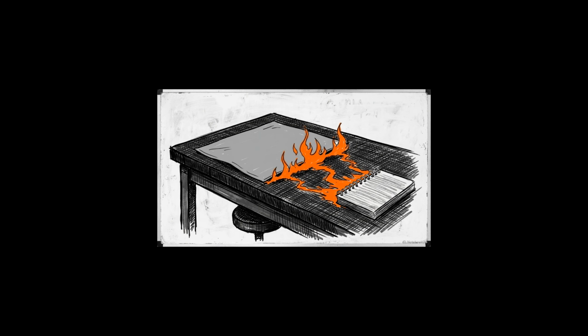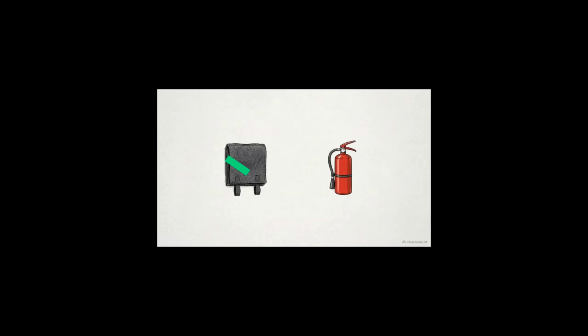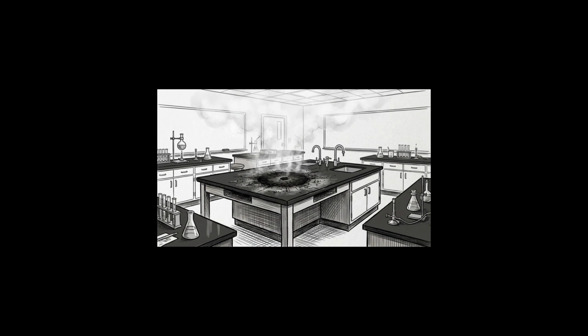If the blanket fails to smother the fire and the flames begin to spread beyond the immediate area, you have crossed the protocol threshold. You must abandon the blanket and retrieve the fire extinguisher. This diagram illustrates the PASS method, which dictates the correct sequence for operating the extinguisher. You pull the pin, aim the nozzle at the base of the fire, squeeze the handle, and sweep from side to side until the fire is out. By mastering the exact physical techniques for the fire blanket and the extinguisher, you ensure a localized bench accident is quickly contained before escalating into a facility-wide disaster.